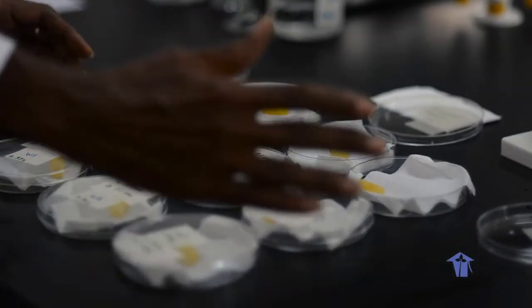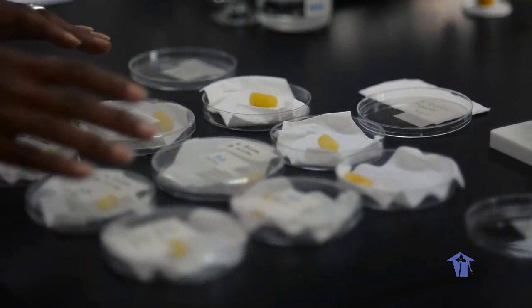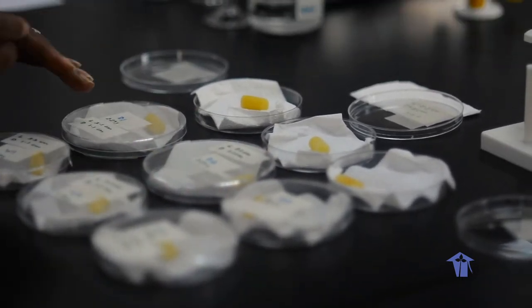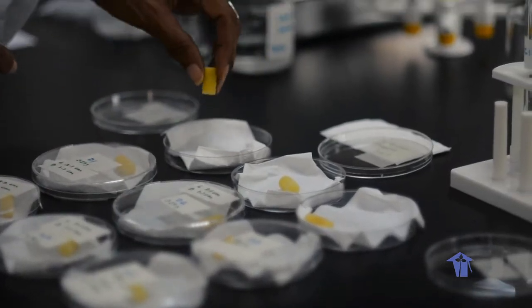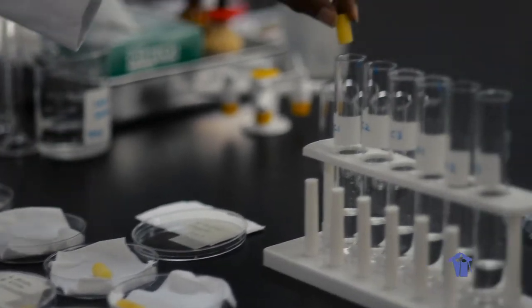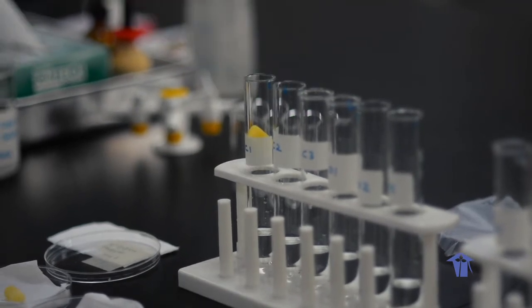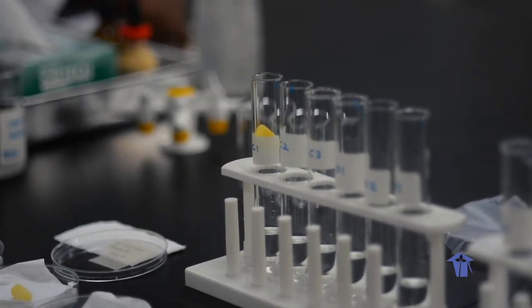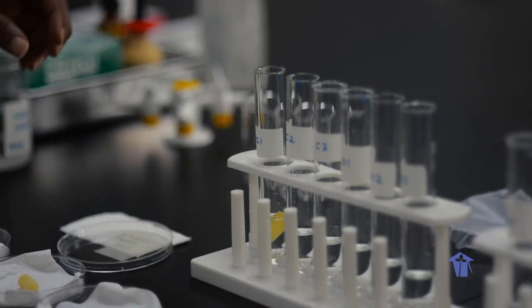Next, now I have laid out all of my potato strips that are supposed to go into the different boiling tubes. So the one that I have open right now are the potato strips that are supposed to go into the tubes containing the concentrated solution. So I'm going to have to make sure that it goes down into it.